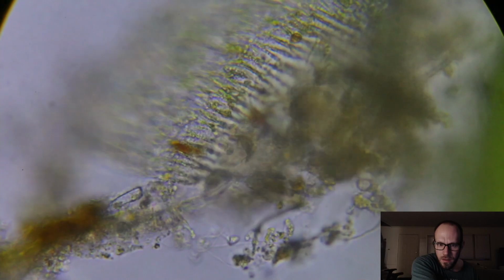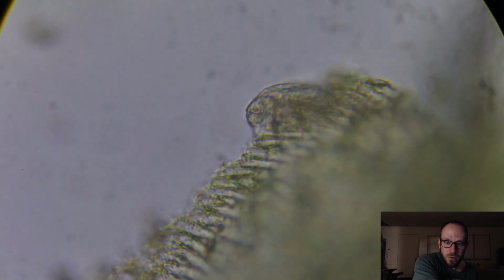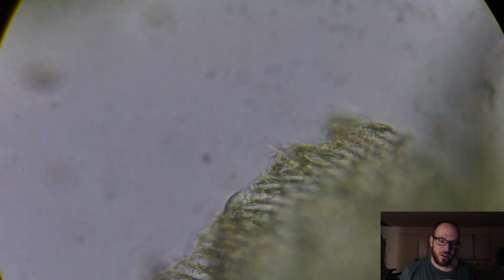What? What the heck? What's happening here? Are you guys fighting? Whoa! Hold up. Wait a minute. Yeah, that's a rotifer. That was just him moving and pushing stuff around. Okay.